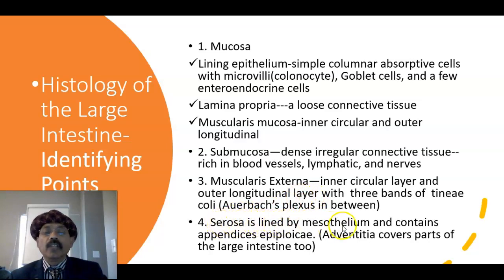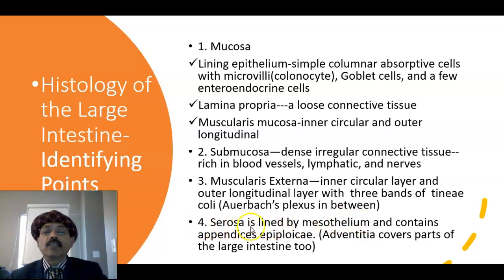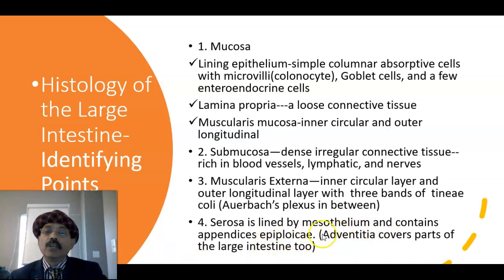The serosa is lined by mesothelium, or visceral peritoneum — that is simple squamous epithelium. Part of the large intestine is retroperitoneal, like that of the ascending colon and the descending colon. So the posterior part is covered by the adventitia, not by the serosa.